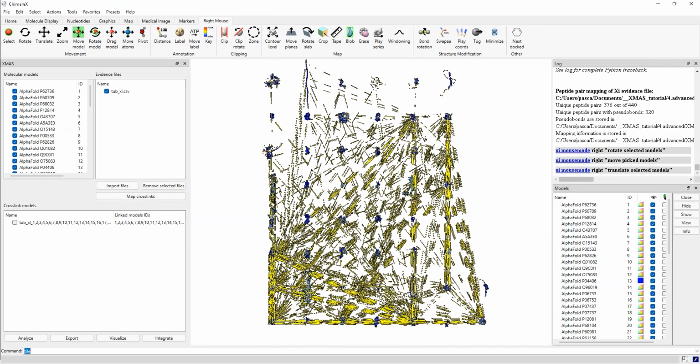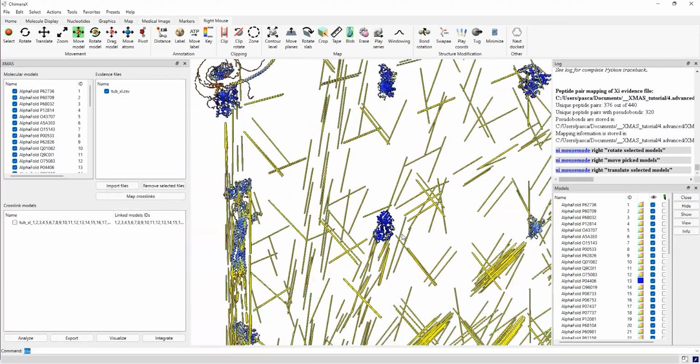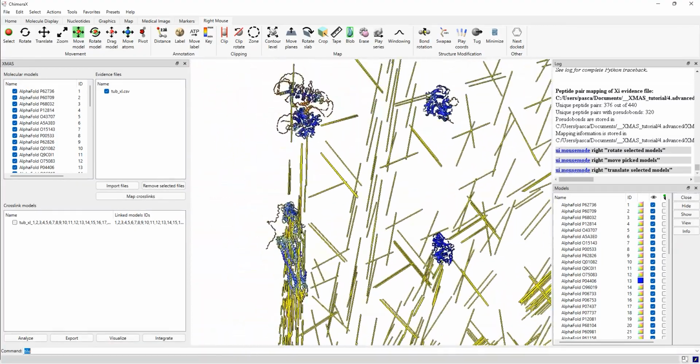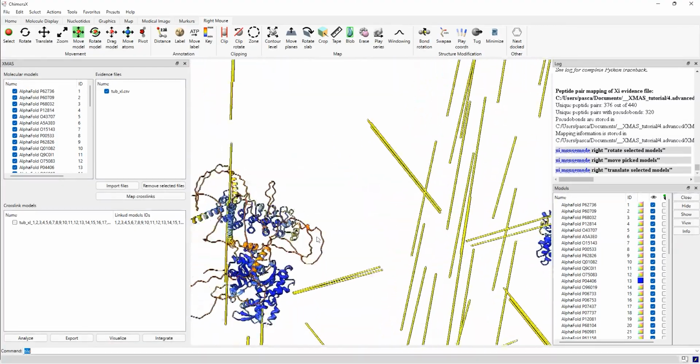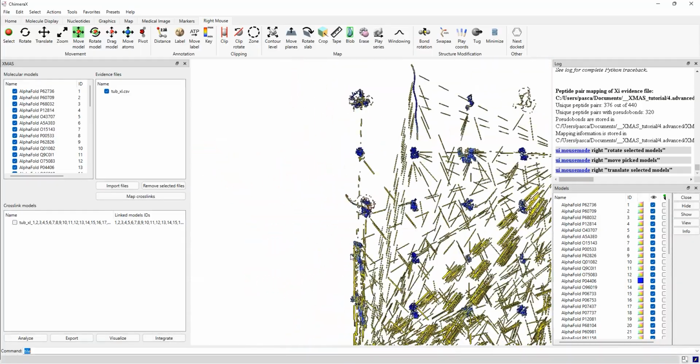And from these, you can then start to look at specific proteins. Of course, this looks a bit messy, but just to show you that in a few seconds, we can get from publicly available data sets and map to structures that are predicted with high confidence. And we have no issue in handling a huge amount of structures and data on a very normal laptop.